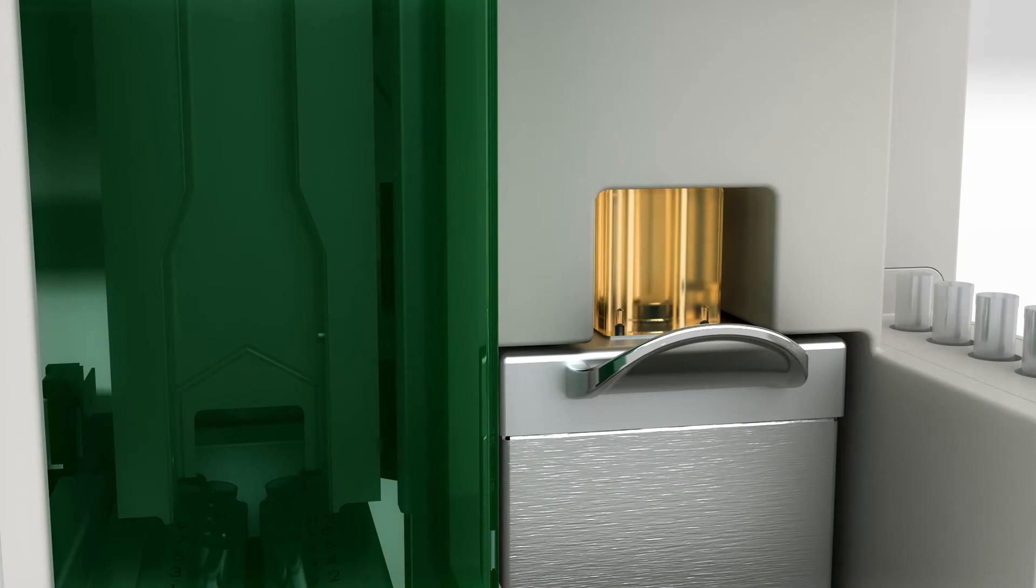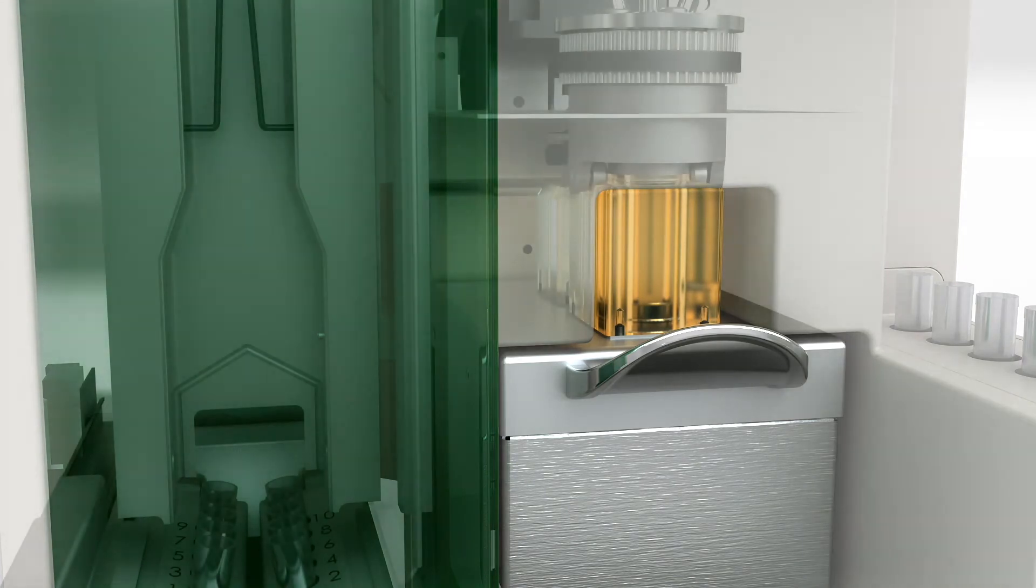The sample stage also continually vortexes your sample to keep cells from clumping or settling, which prevents clog formation and sample loss.